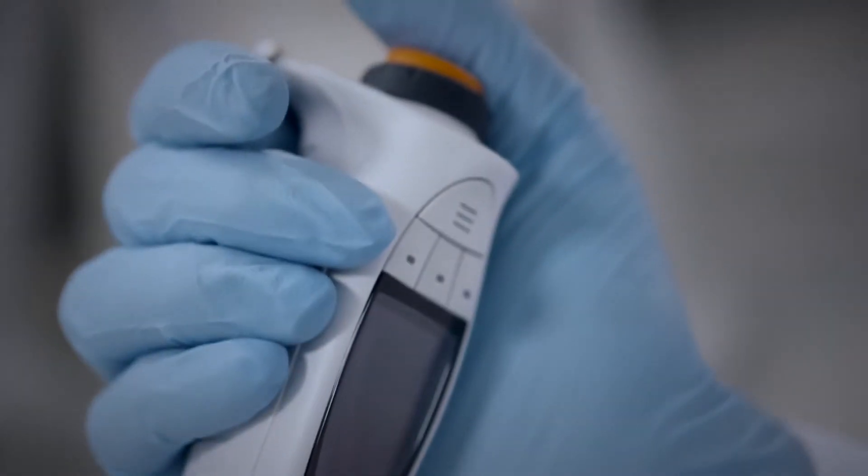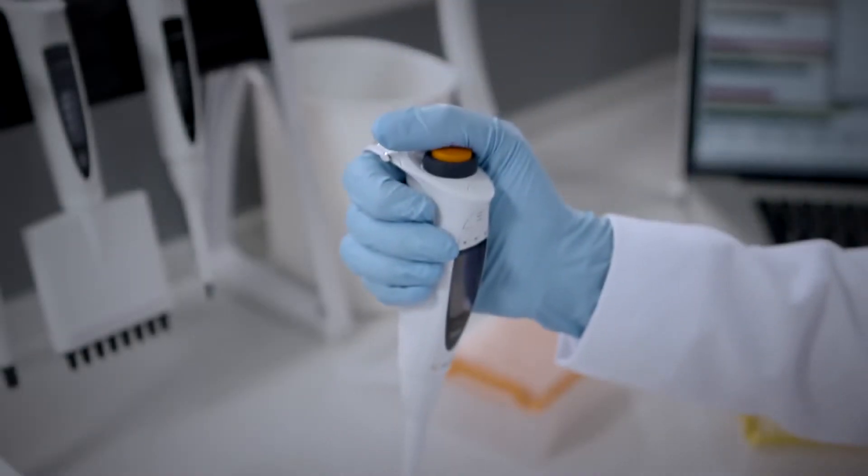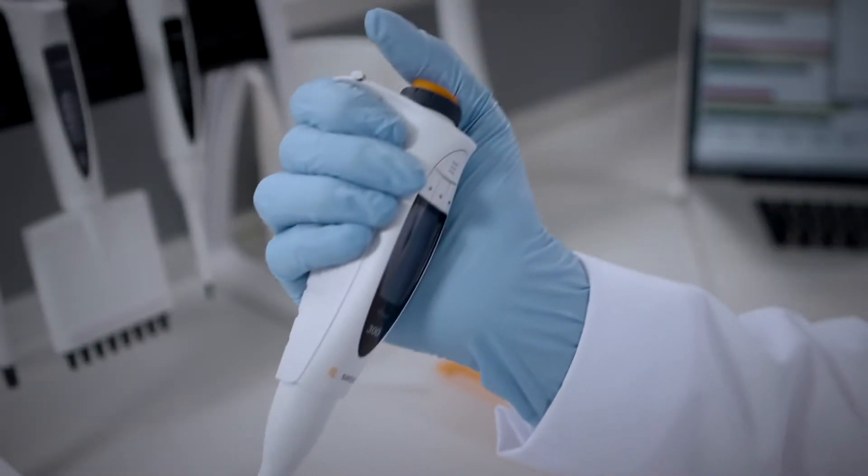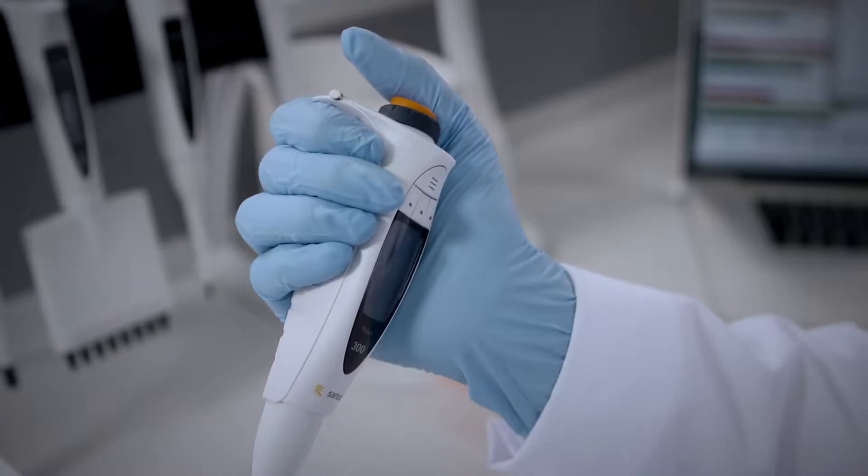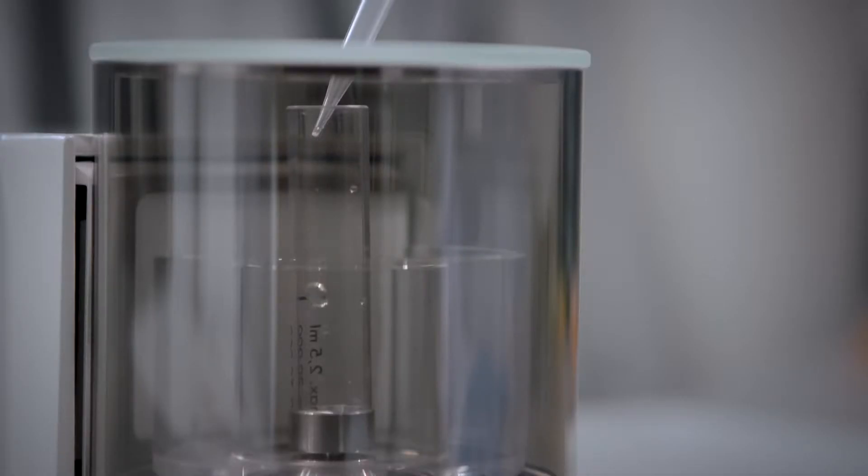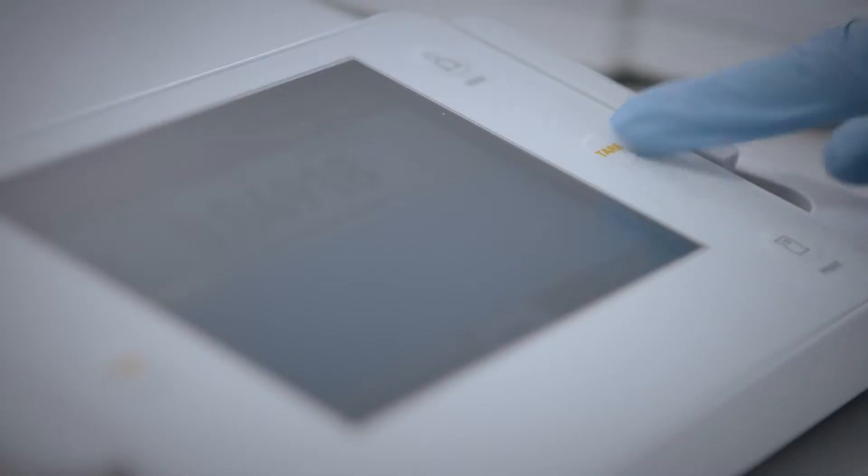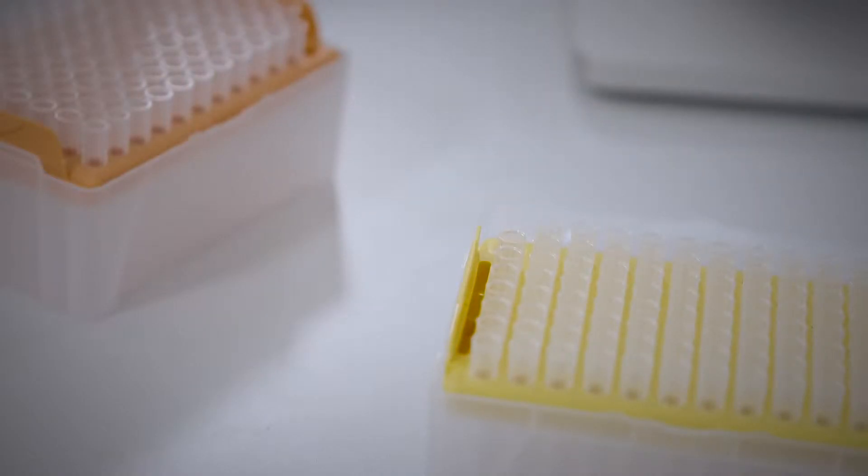Your pipettes need to be calibrated in order to ensure maximum reliability and be confident about the accuracy of your results. The most important factors for pipette calibration are the equipment, procedures, and the environment. This video provides information on all of these factors.